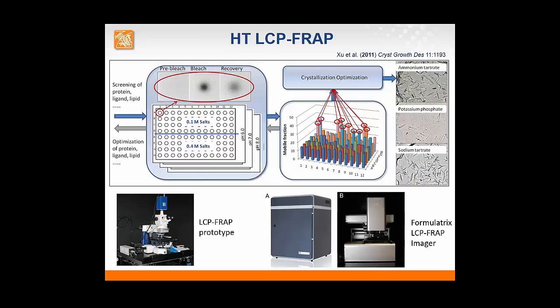We designed a first prototype of this LCP FRAP at the lab, which could do high throughput FRAP automatically, and then Formulatrix took it over and optimized it and created this FRAP imager, which is more user-friendly and faster.